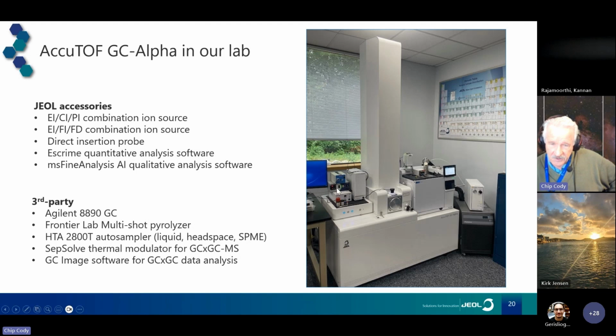In addition, I've got a temperature control box because we've made a modification that allows us to heat up the transfer line as high as 450 degrees for high temperature samples. Mostly that's been used for high boiling petroleum compounds, but it could come in handy for other things. And you also see a programmable reference inlet and power supply for the photoionization source, which is not installed right now. This gives you an idea what everything looks like in place.